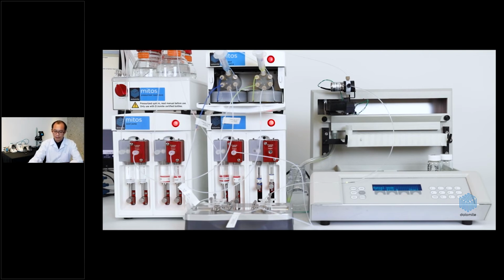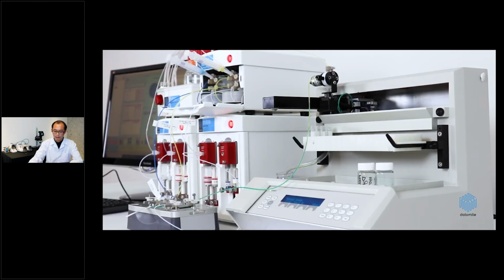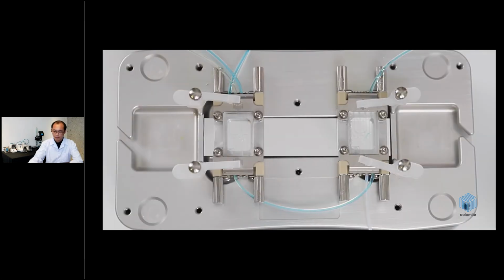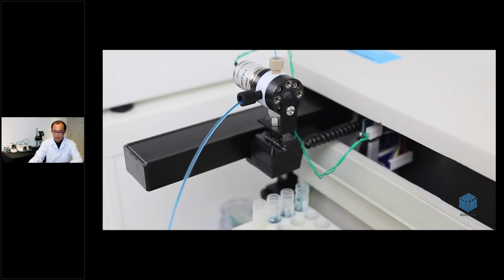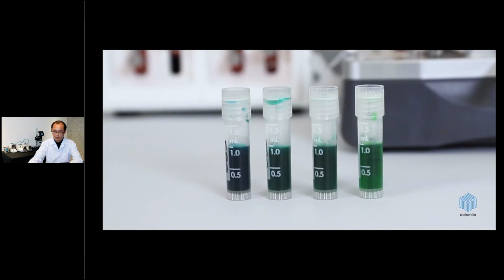Once again, the dye is released at the ratio and the flow rate entered in your experimental table. The 2 dyes converge at the chip and are once again collected by the automated collector in the next vial. As the collection of the sample finishes, the system carries out another wash to prepare for the third experiment. This will carry on until all experiments in your table are complete.